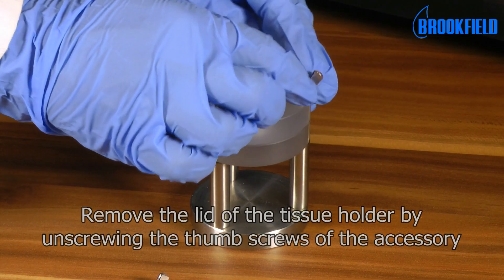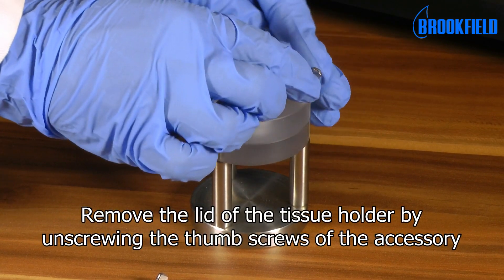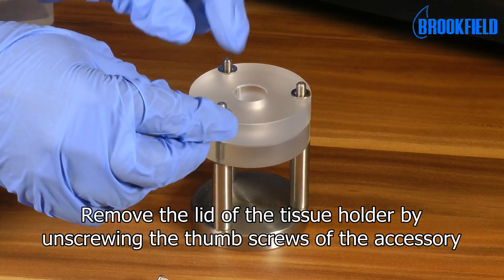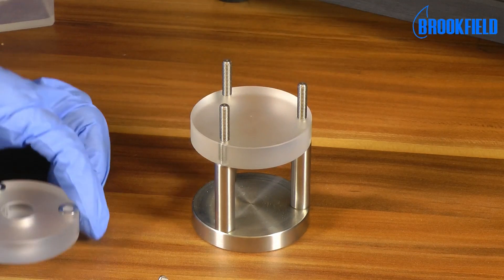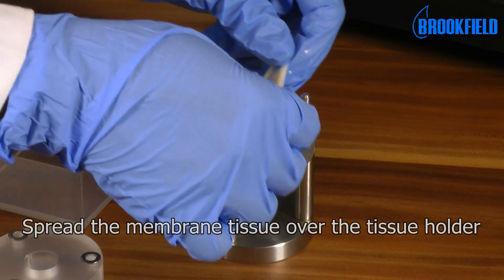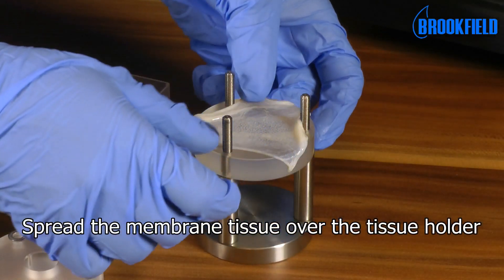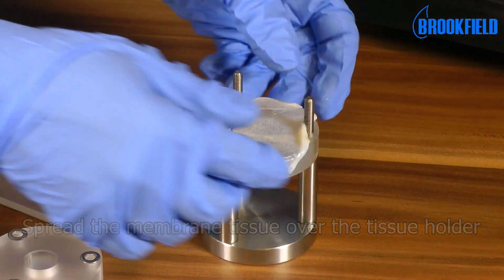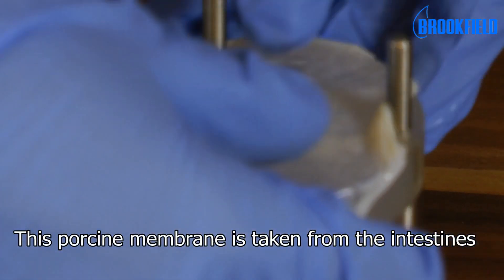Remove the lid of the tissue holder by unscrewing the thumb screws of the accessory. Spread the membrane tissue over the tissue holder. This porcine membrane is taken from the intestines.